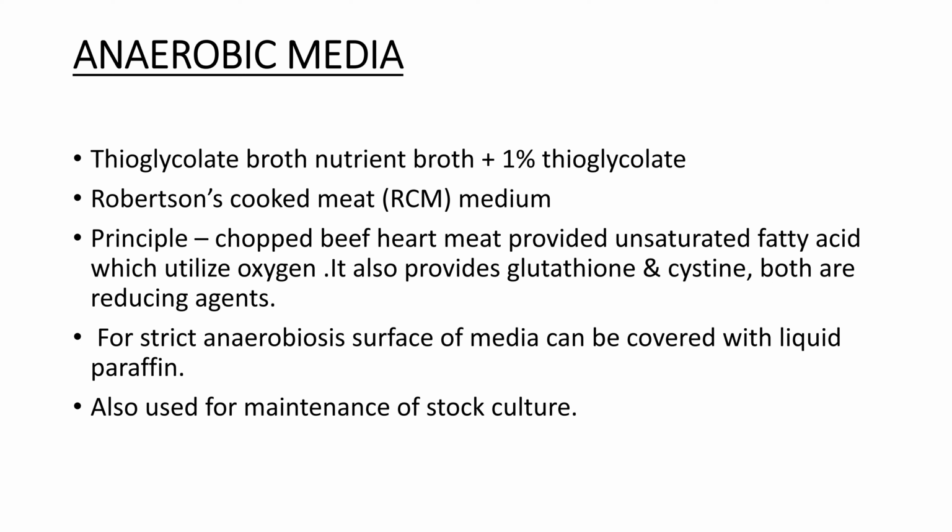So this is the Robertson cooked meat media, and the principle is that the chopped beef heart meat provides the unsaturated fatty acid and hence utilizes the oxygen. It also provides glutathione and cysteine, which act as reducing agents, and therefore it provides strict anaerobiosis. The surface of the Robertson cooked meat media can be covered with liquid paraffin. It is also used for the maintenance of stock cultures.